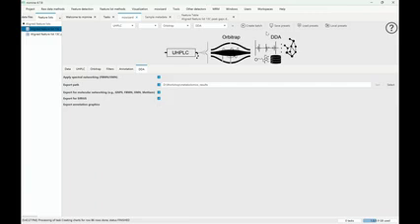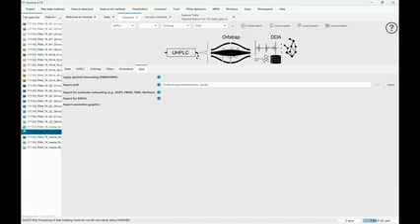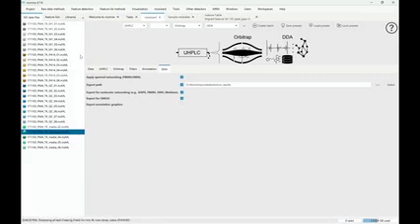So in the process of data annotation or spectral annotation, can I query for product ions or even combinations, product ions and neutral losses in the MS2 spectra to annotate my MS1 features? Yeah, there's currently only a visual way of doing it. We're still working on actually integrating some of these tools more into mzmine, like searching directly for multiple different neutral losses or these significant fragments, let's say.